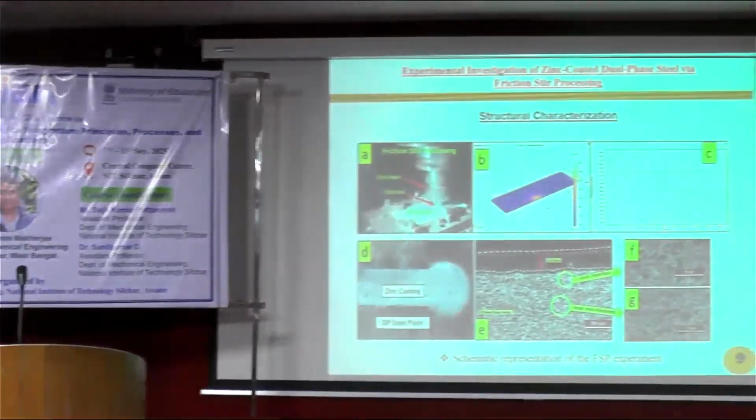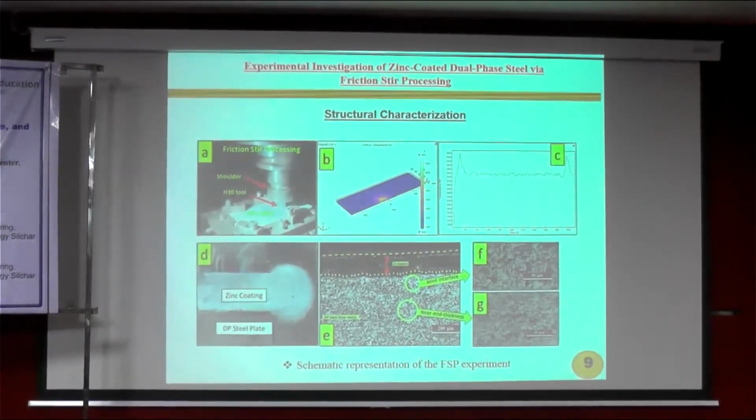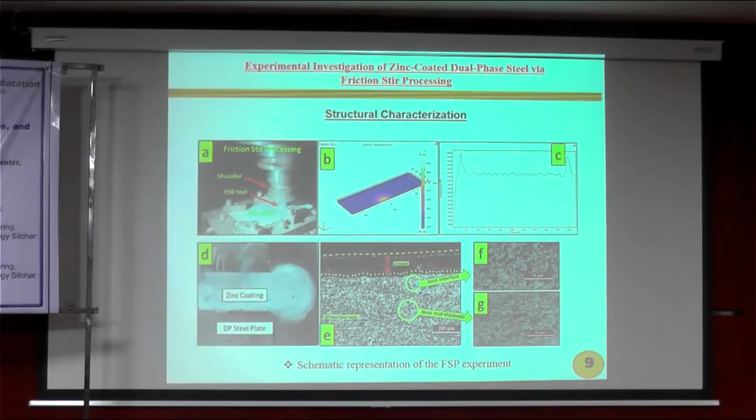Now, our aim is to see how effective the coating can be without deteriorating the substrate. So during the processing, is any parent material getting affected or not? For that study, we have taken two locations. One is adjacent to the coating interface. Another is far away from the coating region. At these two locations we have studied the microstructure and the properties. Is there any change happening or not?